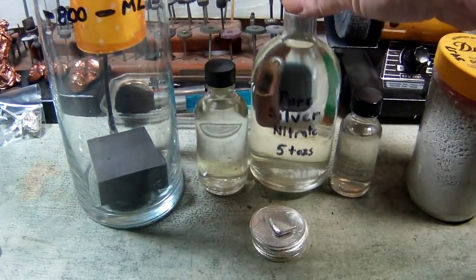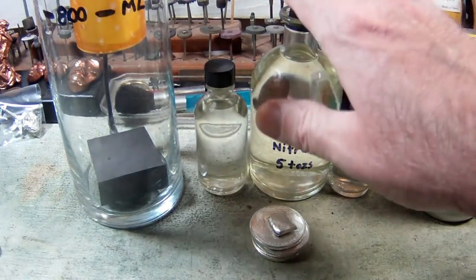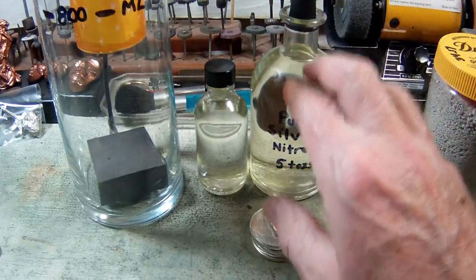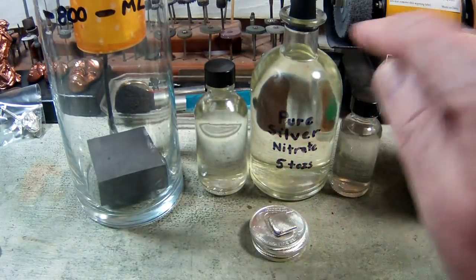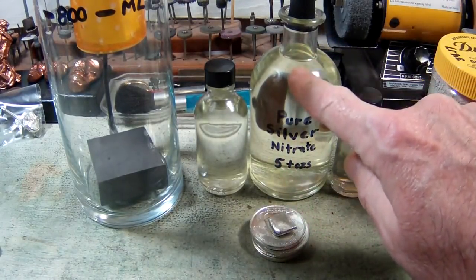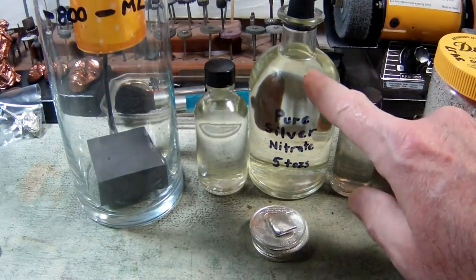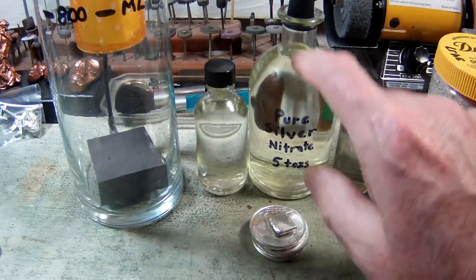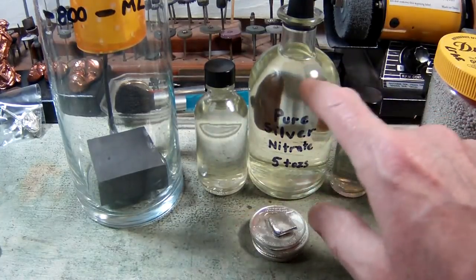The reason this silver nitrate is absolutely clear is because there are no impurities in it — no copper, nothing else. It's just silver. That's why it's clear. If it had other impurities such as a little bit of copper or other base metals, you would see it because it would show up as color.